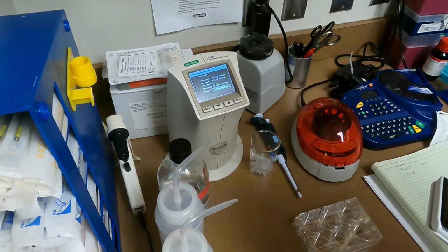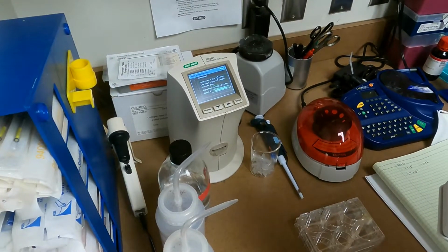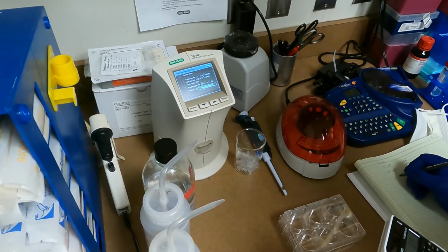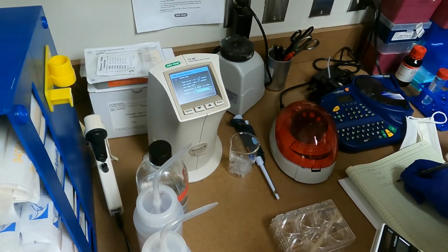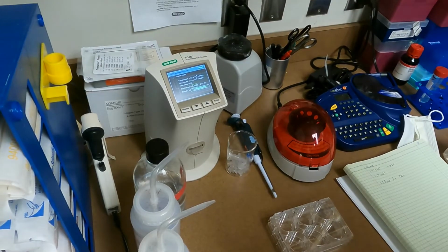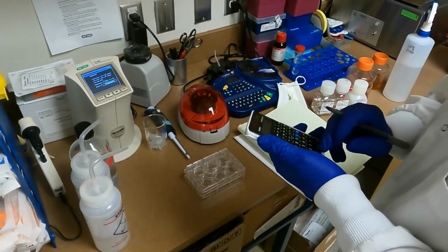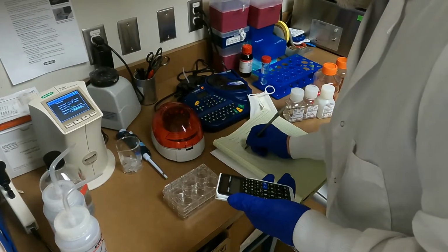So we take the average of the two: 1.27 plus 1.22, divided by 2. So that means we've got about 1.25 times 10 to the 6 per mil in the PBS. Now if we want to concentrate this up to 5 million a mil, we'll have to concentrate it 5 divided by 1.25, 4 times. So that's nice and easy.